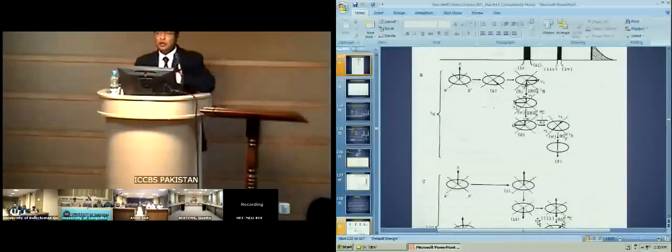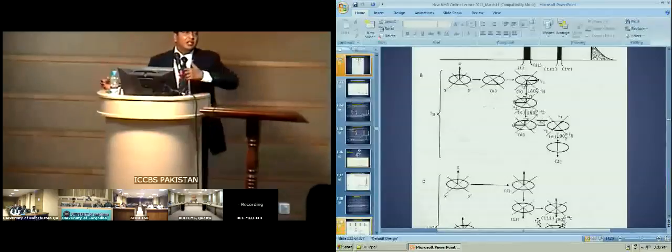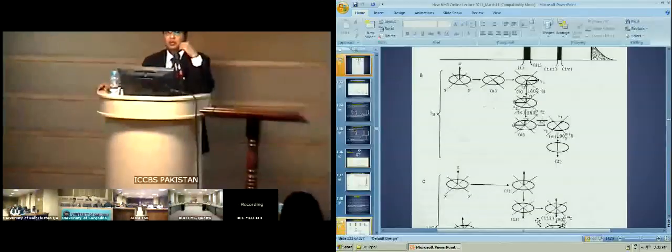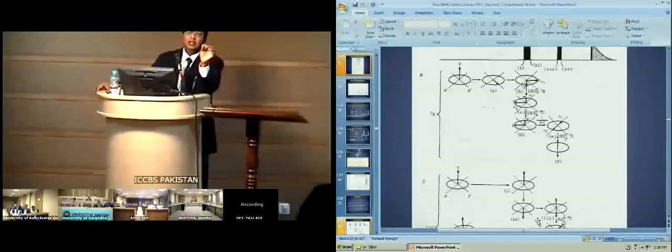But if you want to transfer all the protons' population to all the carbons in the system, it is called INEPT, insensitive nuclei enhancement by polarization transfer. This is a very powerful technique, but if you want to use it selectively, lots of people, including Douglas Kinghorn, have done wonderful work using SINEPT, because at that time HMQC was not available.